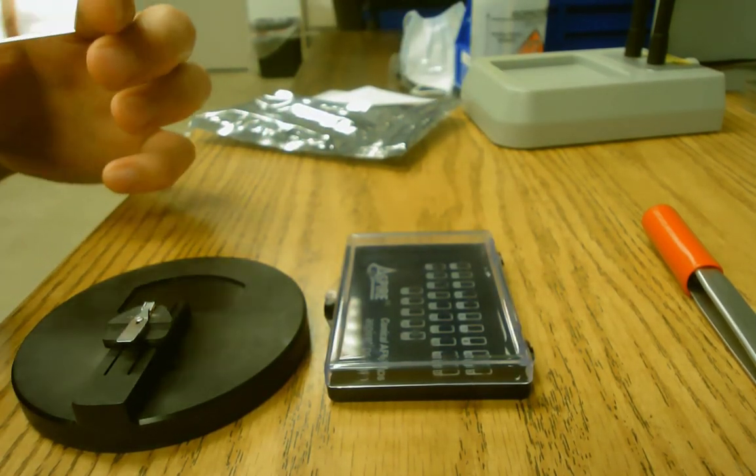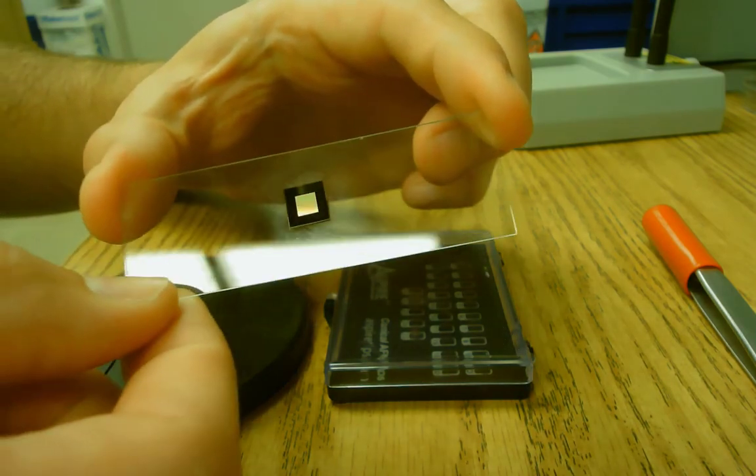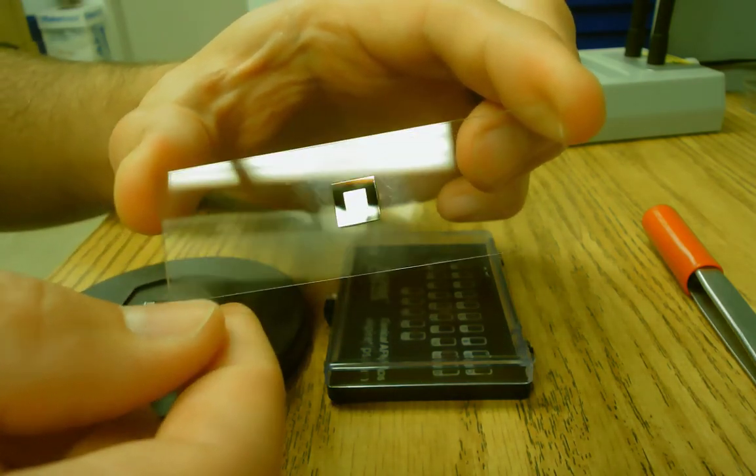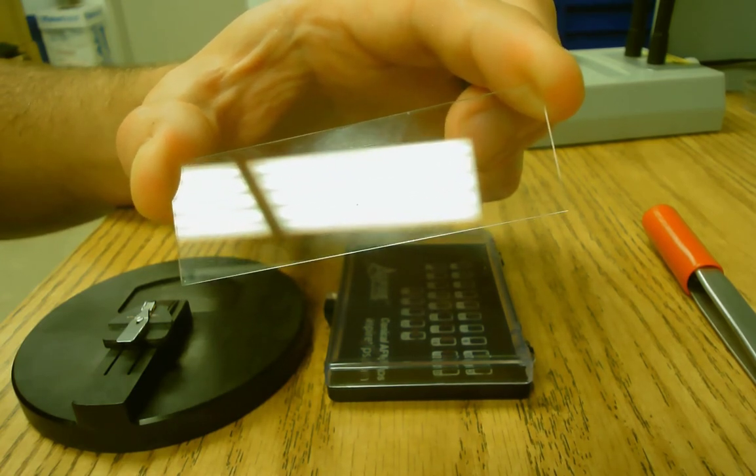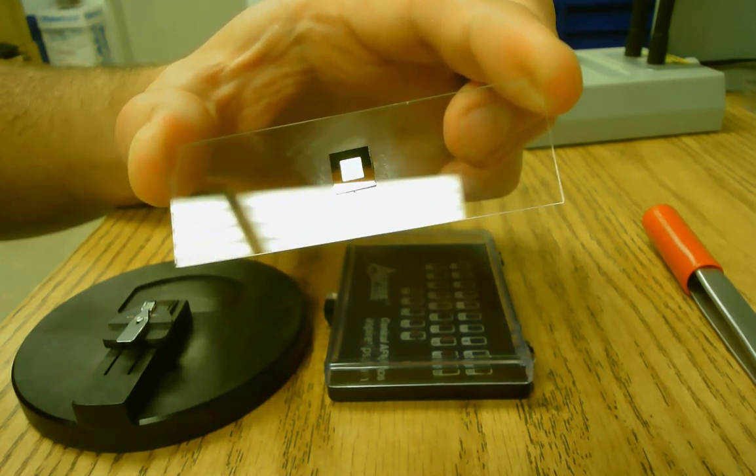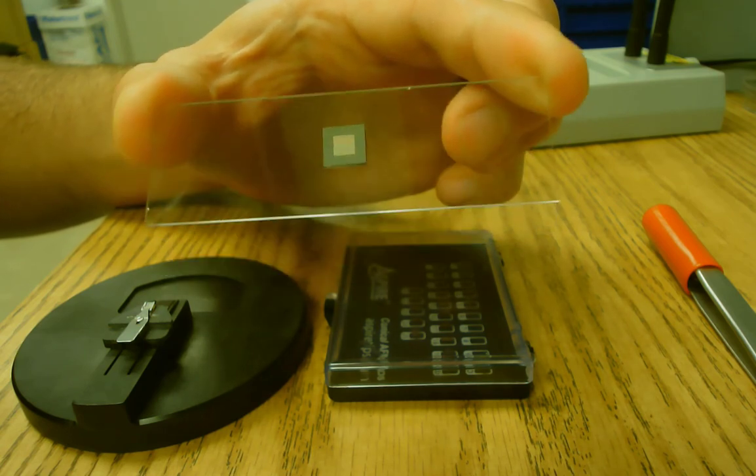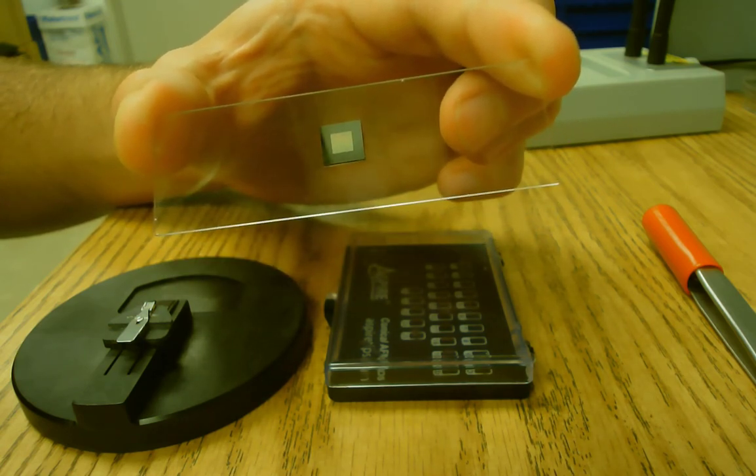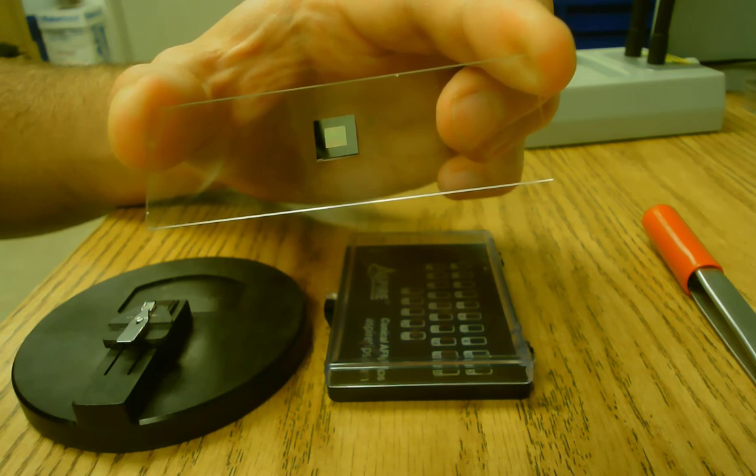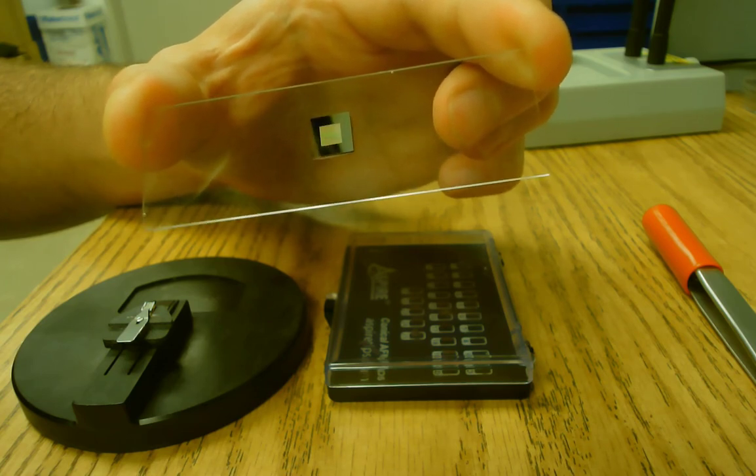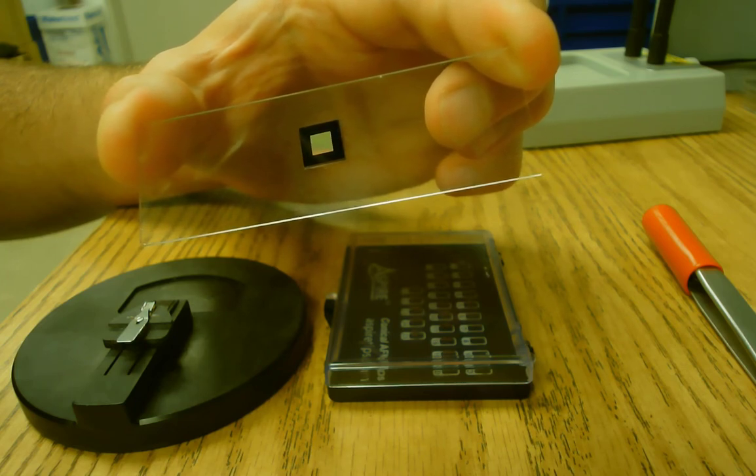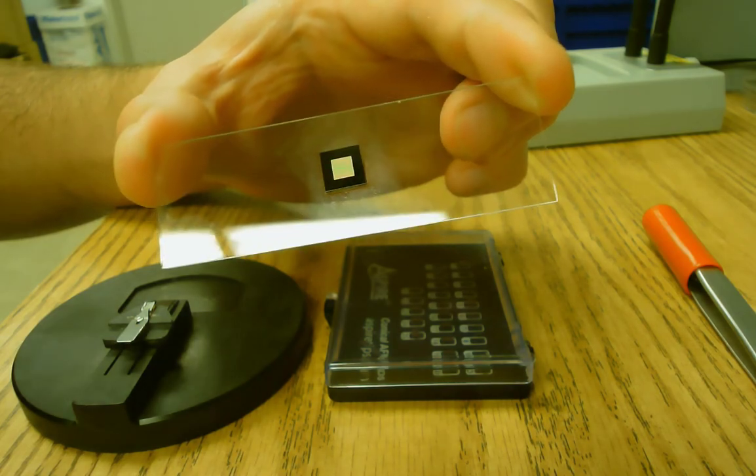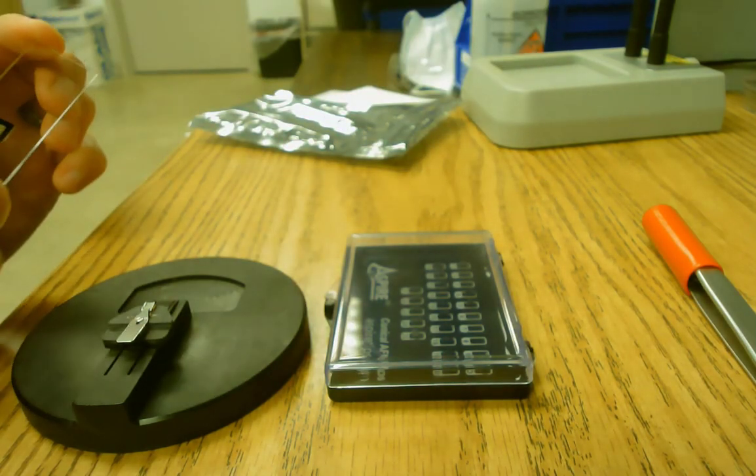We're going to image two different things. One of them is a standard. So this is an x, y, and z standard. It has a grid of square pits. So the pits are square and have a depth of 180 nanometers and a pitch of 10 micrometers. So the pitch is the distance between one edge of a square to the same edge of the next square. So we're going to image this as an example.